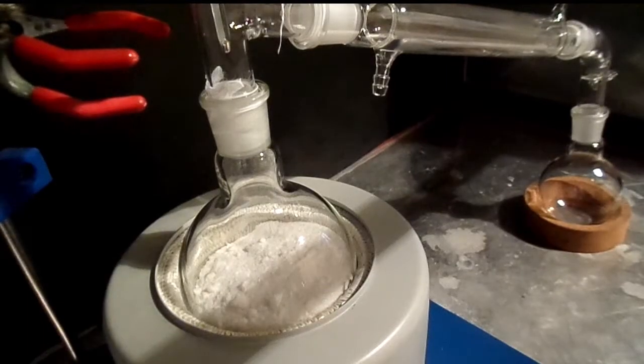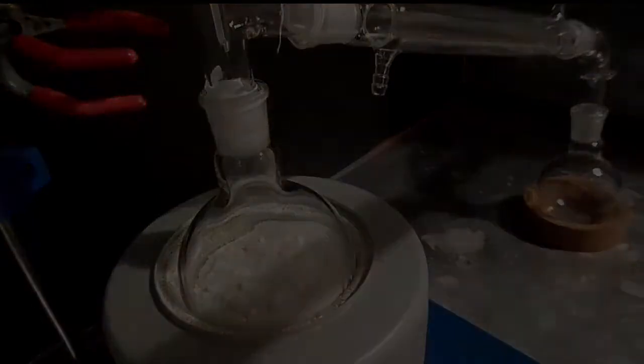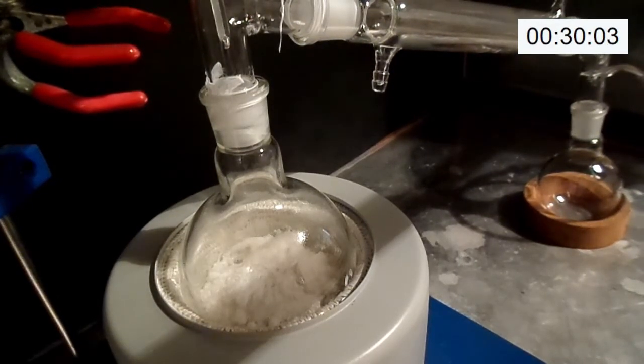To begin the reaction, the flask is heated to 155 degrees Celsius, by which point our benzamide and ammonium sulfamate melt together. After the 30 minute mark, we can see some small amount of water is released, which means my reagents weren't as dried as I hoped they were, but this shouldn't present too much of an issue.